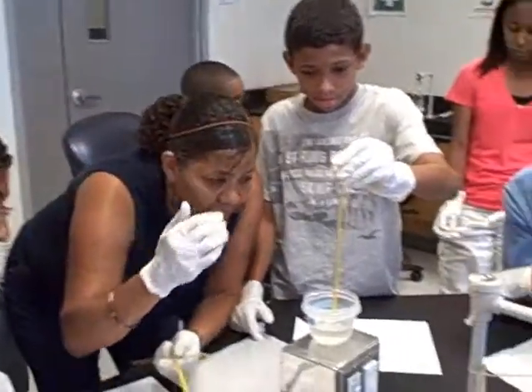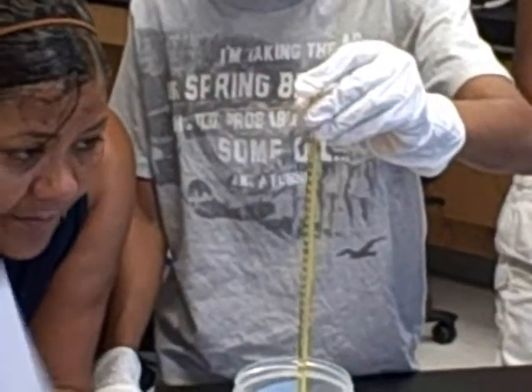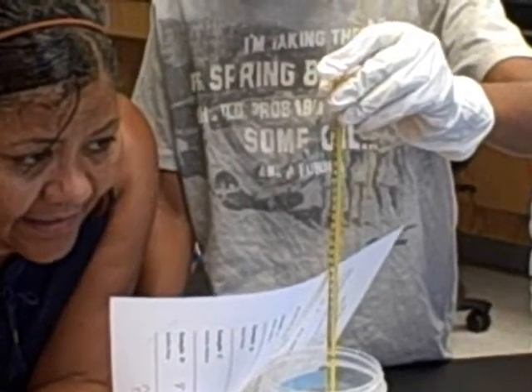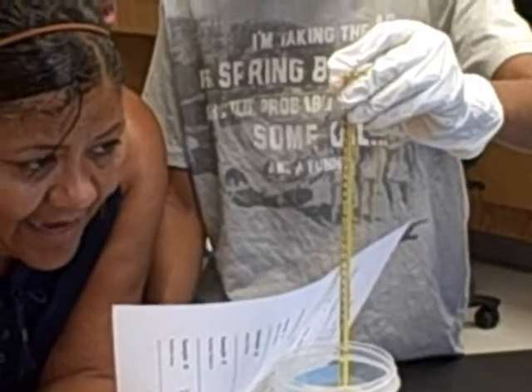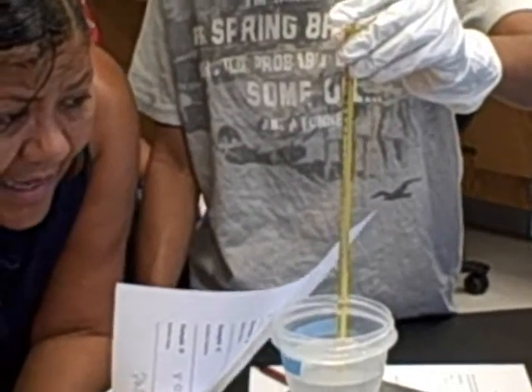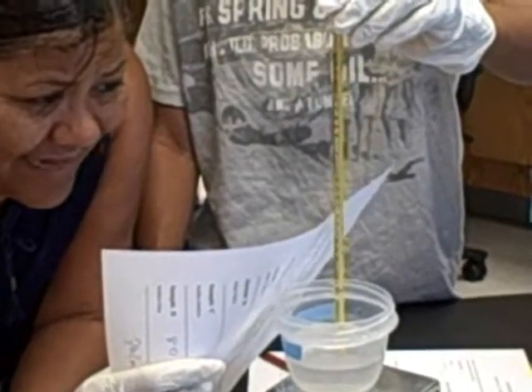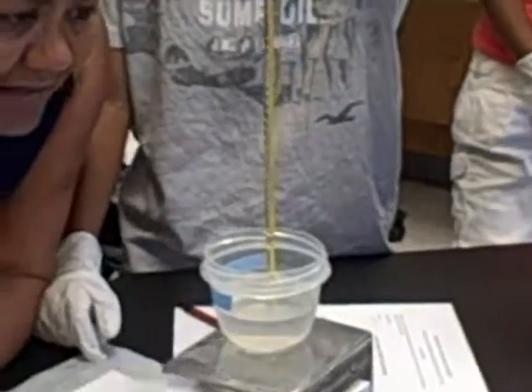If you all, eyes down here, if you look at this sample, I want to take this white piece of paper and you hold it right here when you can't see for sure. That's the 20 there, 19, and it's right under 19, so we can't read in between, so if it's in the middle, we'll call it 18.5. Let's see what it says on the other side.